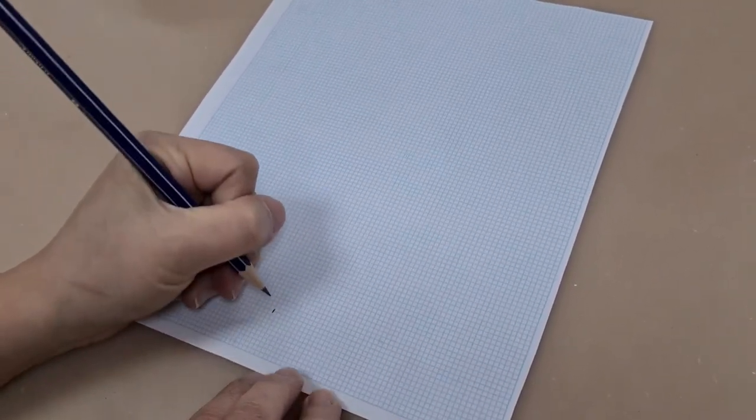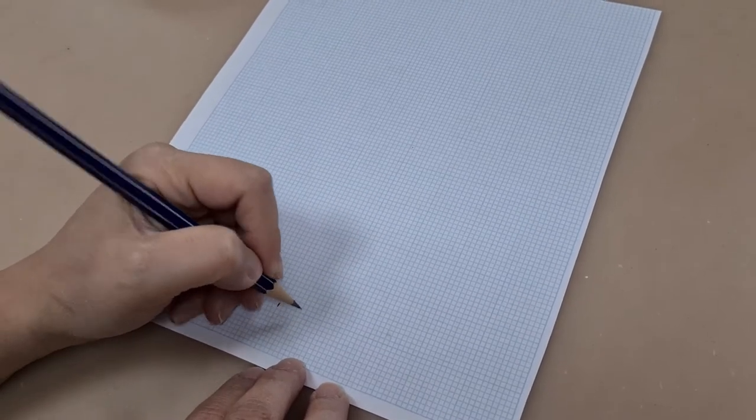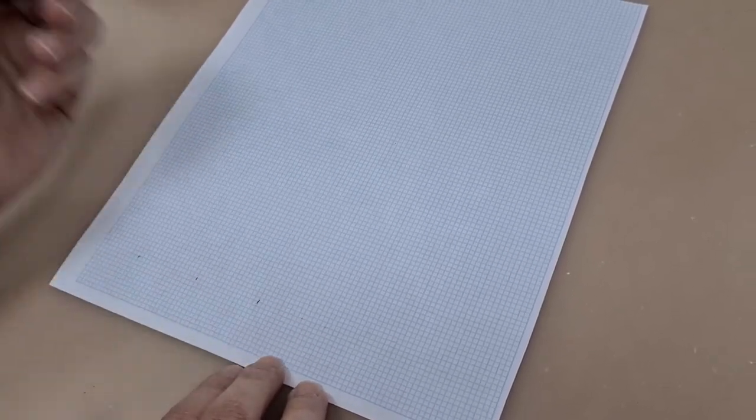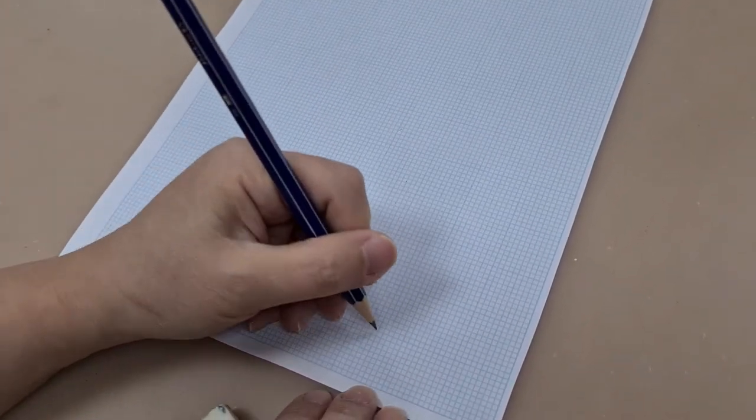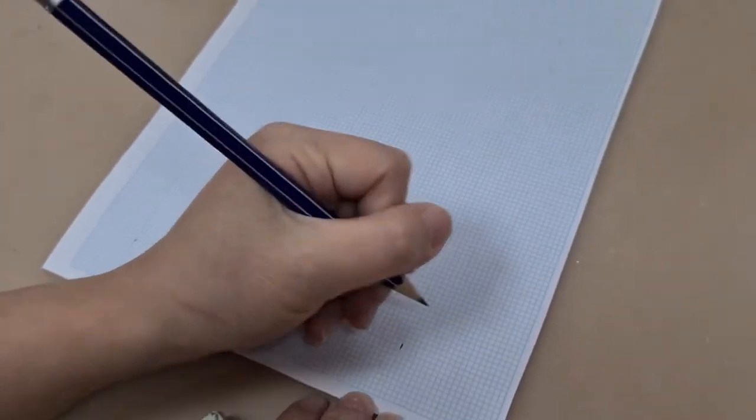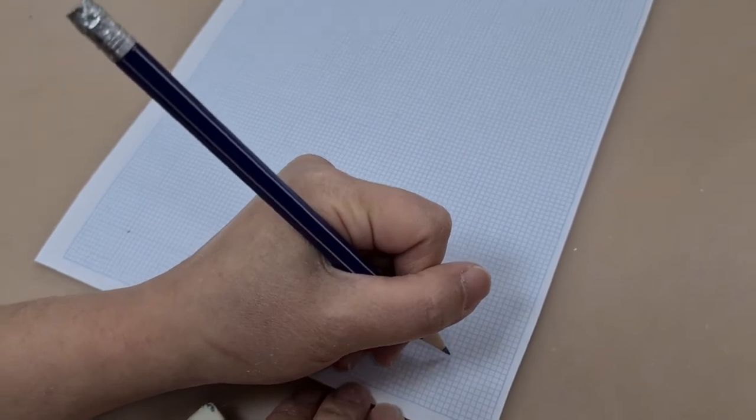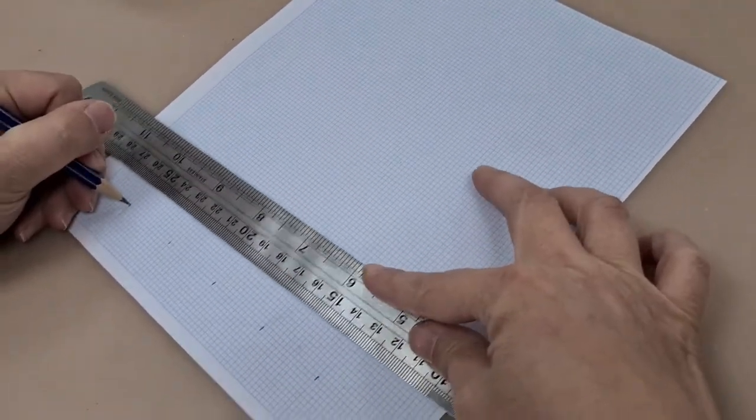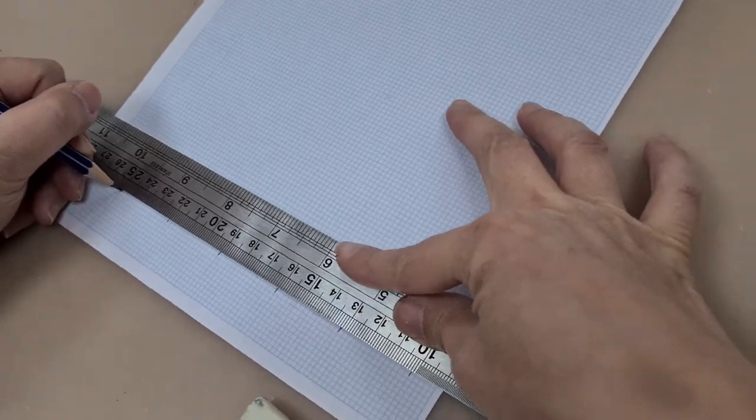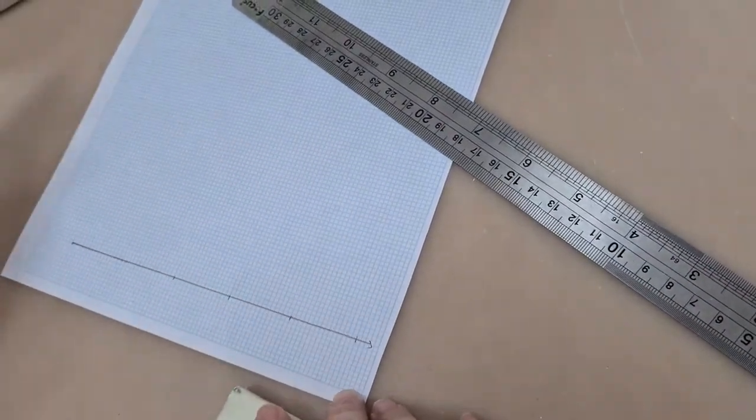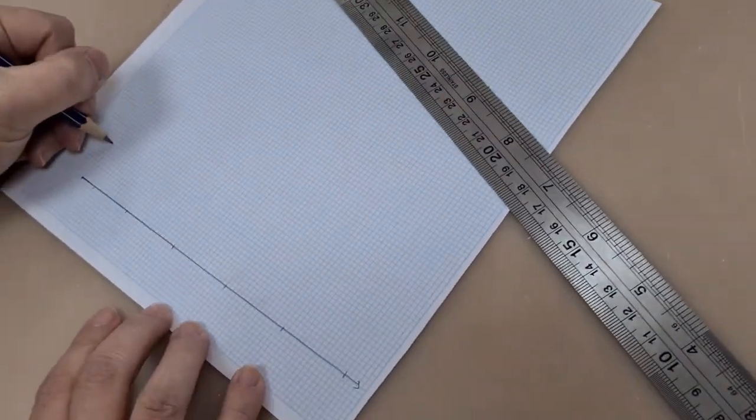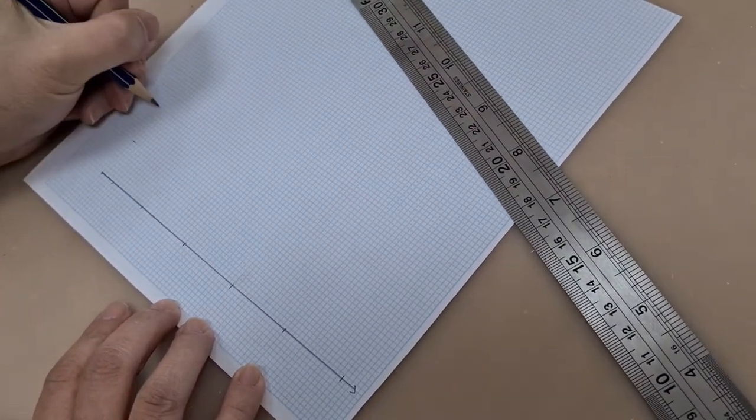I've got to work out the scale. I've got to take as much of the graph paper as I possibly can and on the y-axis I'm going to have absorbance. Now in the last video there were a couple of pointers about the graph work and one of them was that the scale didn't fill very much of the page. However, I can see that we're using the maximum scale available to us.